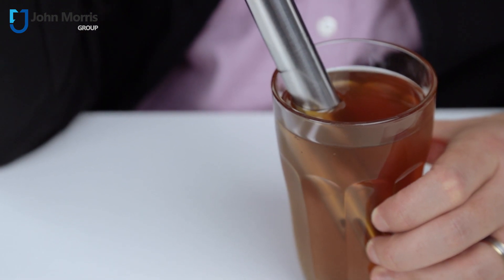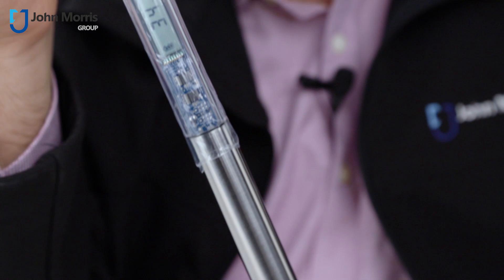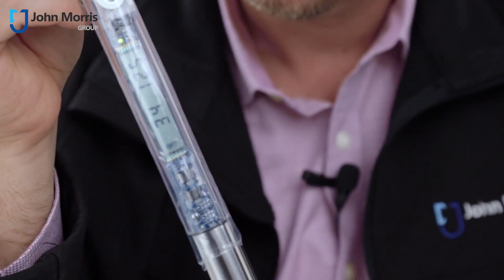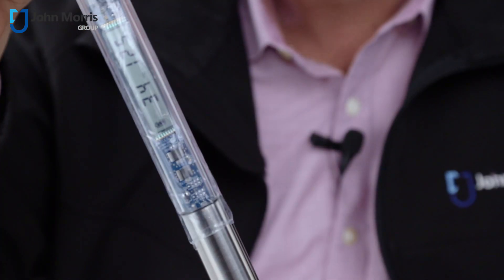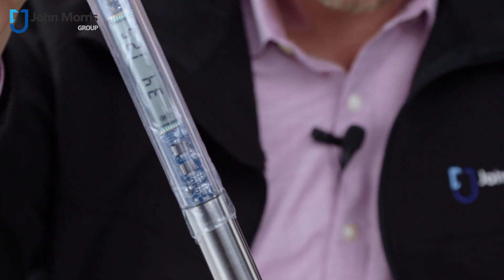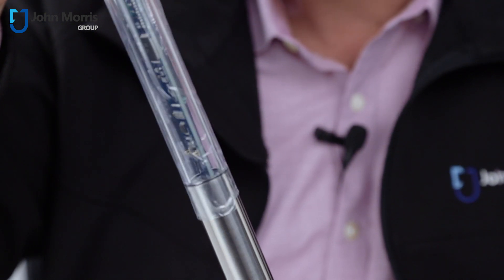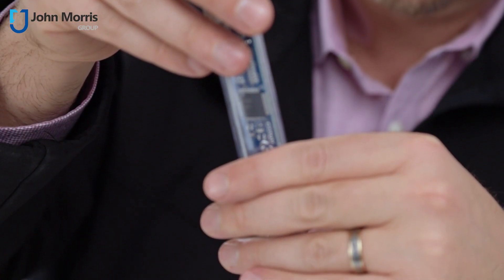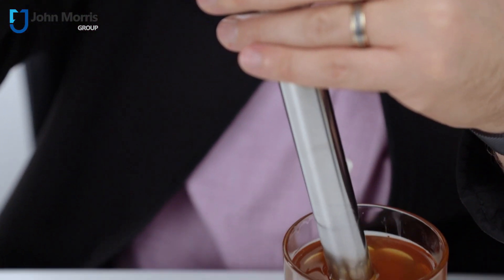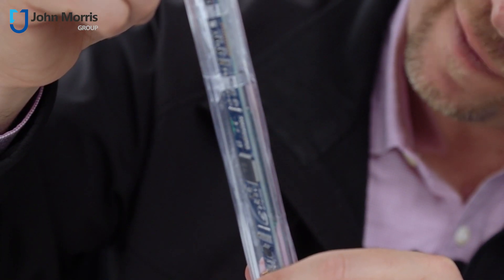Let's see how we go with the oil from the local fish and chip shop. As you'd expect, the reading is quite a bit higher, but I'm really happy to see that the reading is well under 25%. I really like this local fish and chip shop — I go there almost every day for lunch. And at 12.5%, it's still well and truly safe to use. So let's go from total polar to acid value and have a bit of a look. The acid value in this particular oil is 1.15.